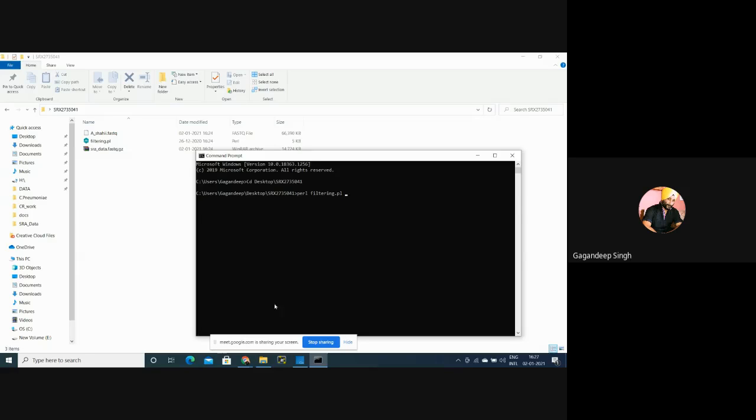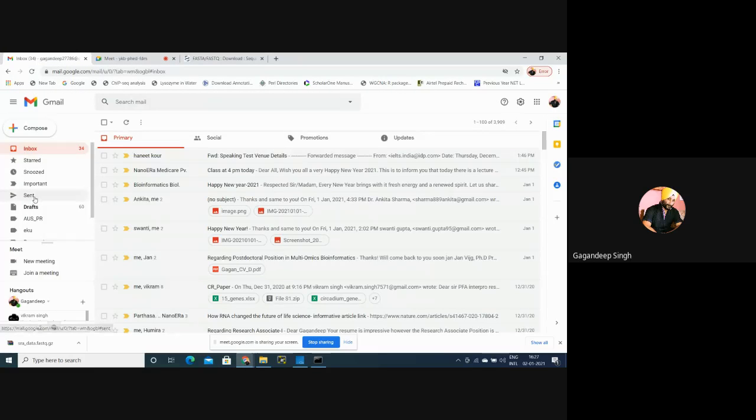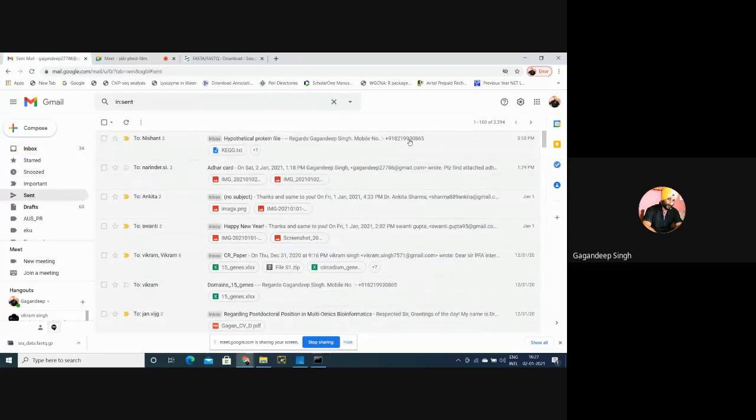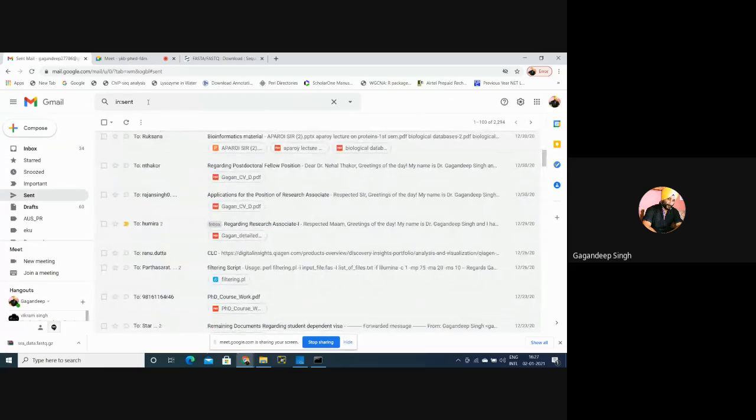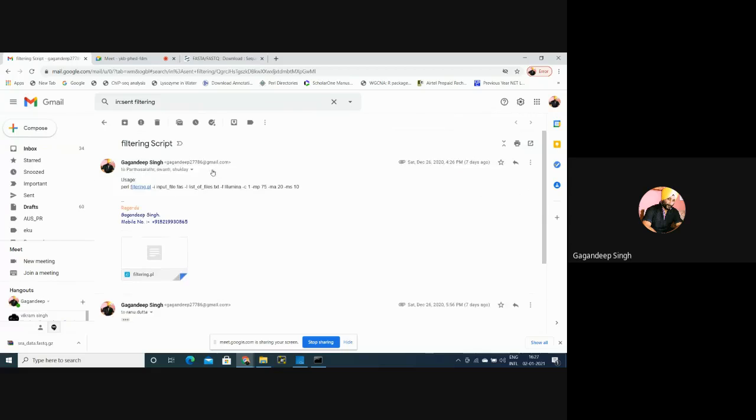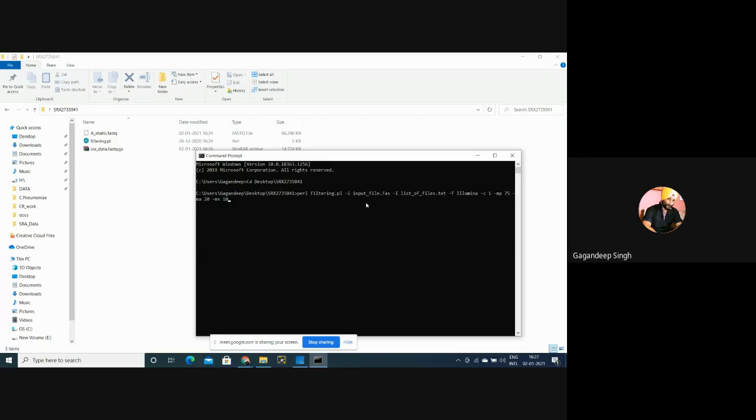What was the command? Do you remember? I have shared it with you. I'll see. What is the name of the input file here? A shahi.fastq.